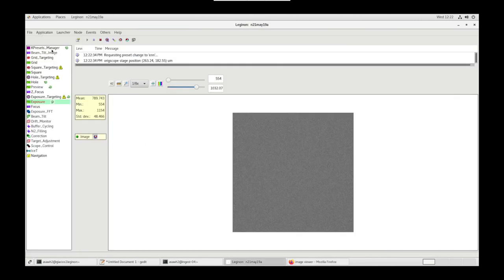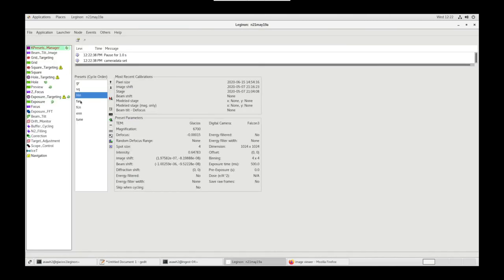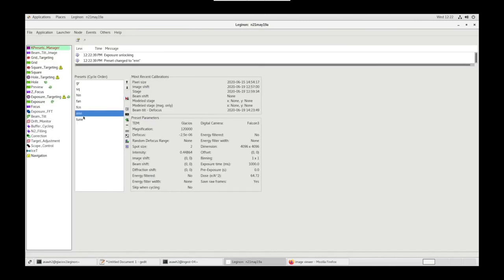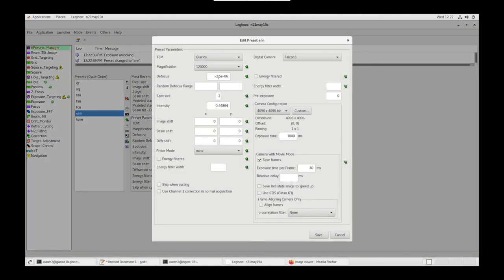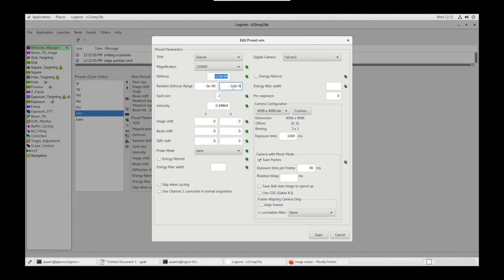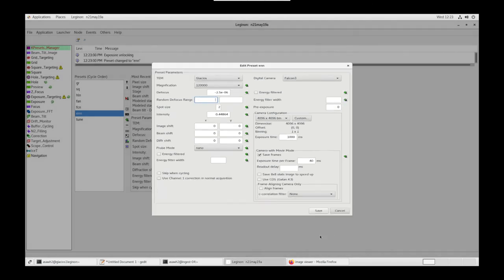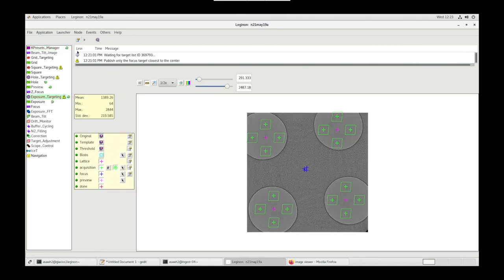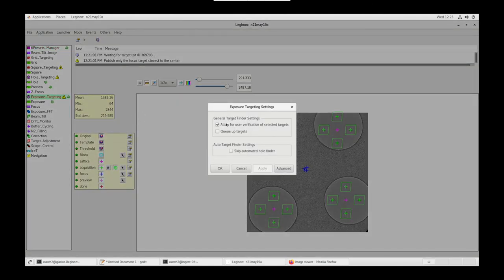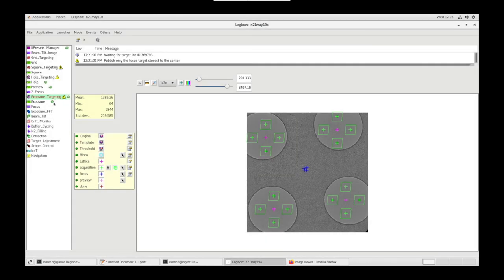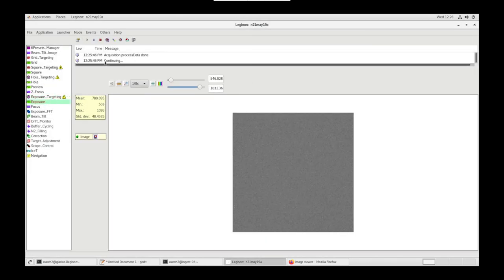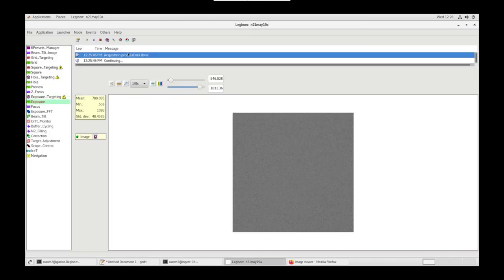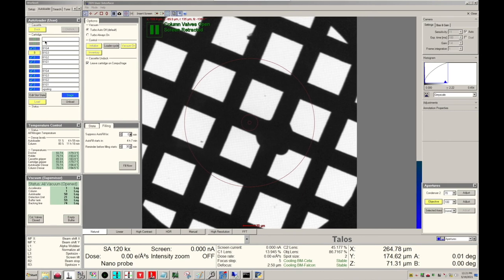Go back to Legenon, go to Presets Manager, go to ENN, Settings, and you can change your defocus here, or you can create a random defocus range. Once your queue is set, you can toggle Error Notification, and this will close column valves when the scope is inactive for 30 minutes. In Exposure Targeting settings, we can take off Allow for User Verification. Exposure node, when acquisition process data is done, you can then end your session.